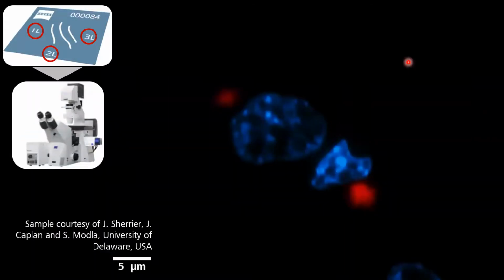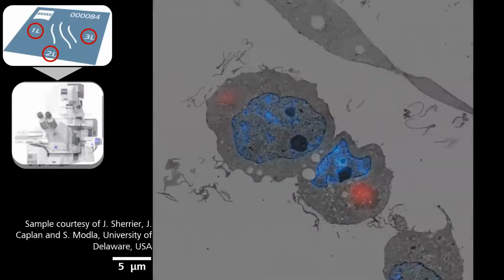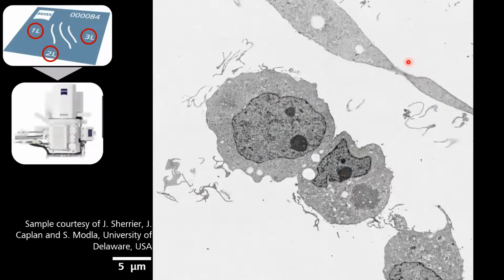I brought you an experiment here of one of those examples. Again, these are thin sections of a HeLa cell, and in that case, we use the DAPI stain for the nucleus, and eventually huntingtin here in red. And as argued before, we can only see what we marked. We see the nucleus and this huntingtin, but nothing much else. Again, on electron microscopy, we see all the structures that actually bind up heavy metals, and of course by the structure we can indicate this is a nucleus with a plasma membrane. There's some filopodia maybe from those HeLa cells, and all of that can be visualized.